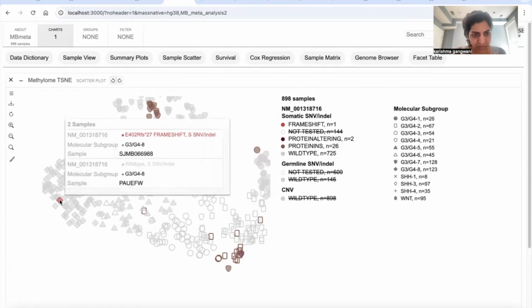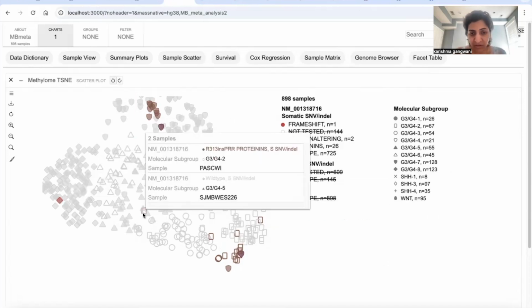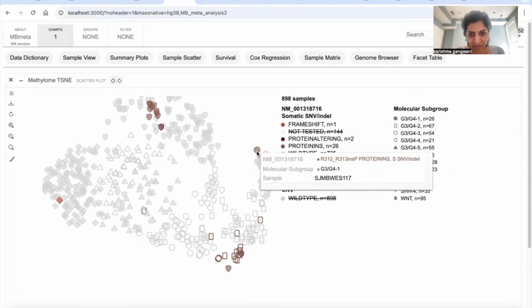And then we also see frame shifts for subtype 8. We see another subtype 2, which is sitting away from the remainder of its cluster. And then a mutation in subtype 1, which is a single codon with the proline. So the question naturally becomes: are these potentially misclassified?